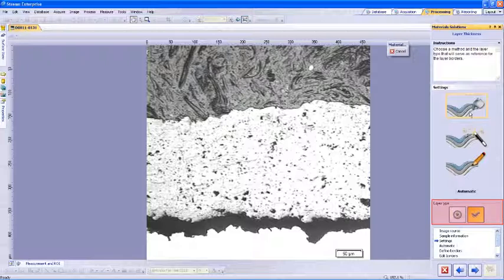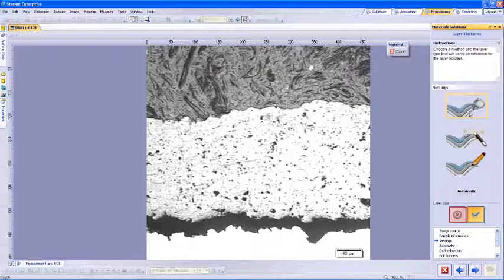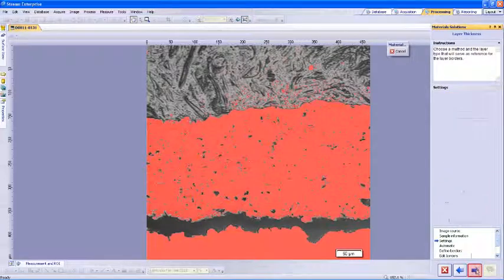We also have the choice of layer type at the bottom. With an open layer type, you can measure layer structures that continue through the image. When you have a closed layer type, you can measure circular layer structures. In closed layer, the contour line's first point is automatically connected to its last point. Once you have the settings completed, you can click the next arrow to move to automatic.